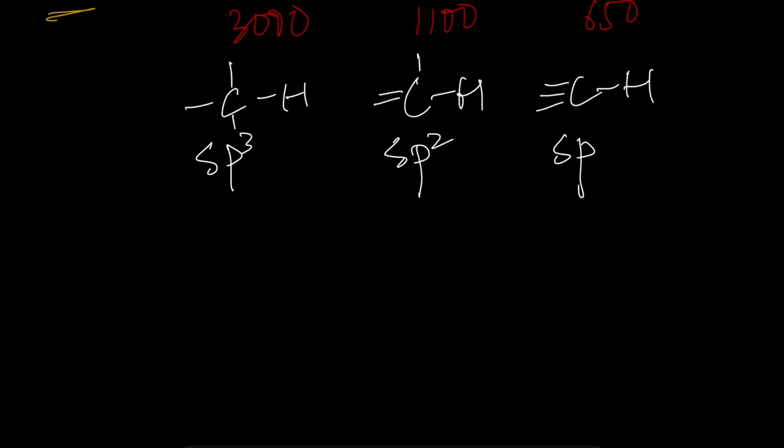But now we are focusing on the C-H bond, the one that we want to compare. They are the carbons with different hybridization states.